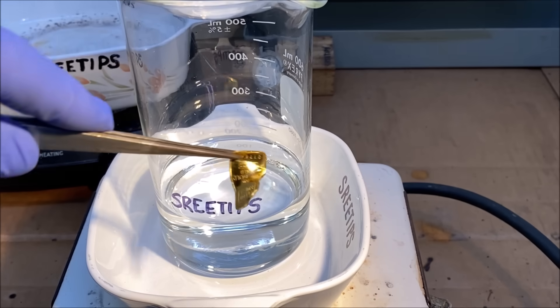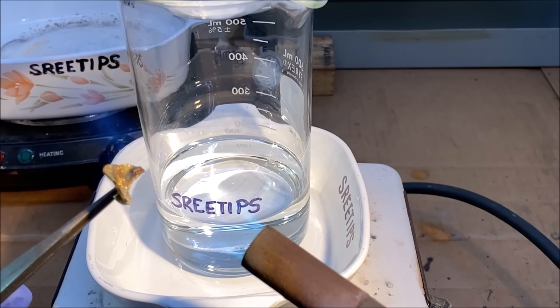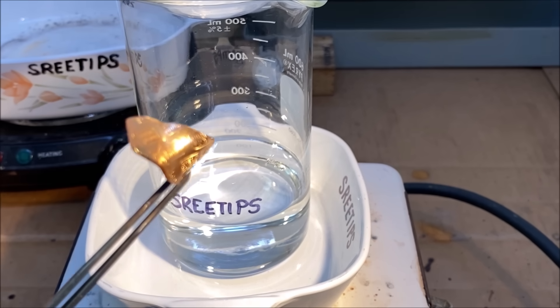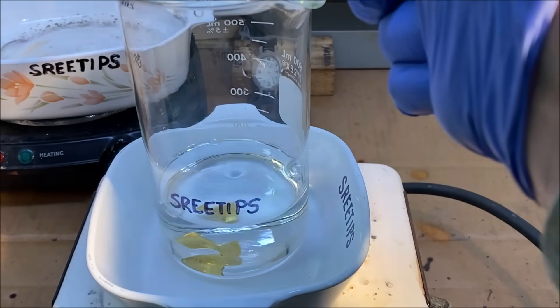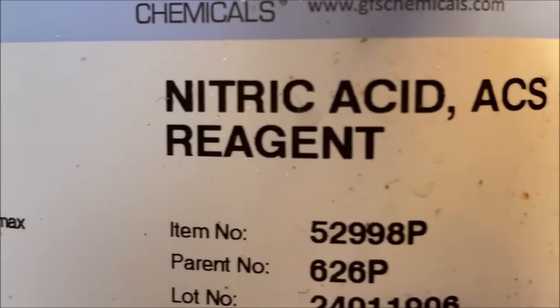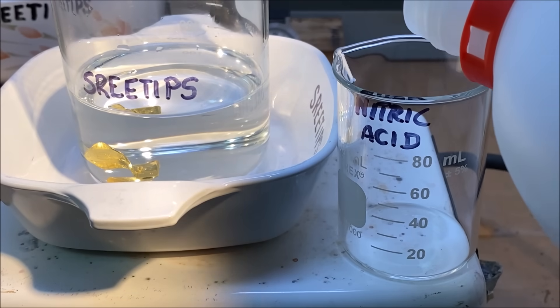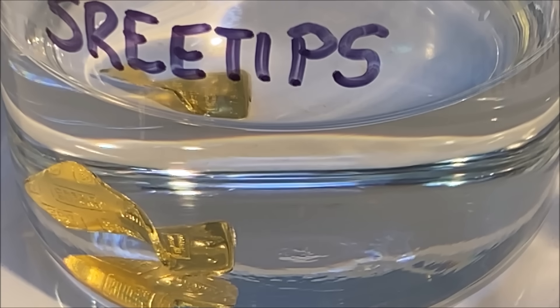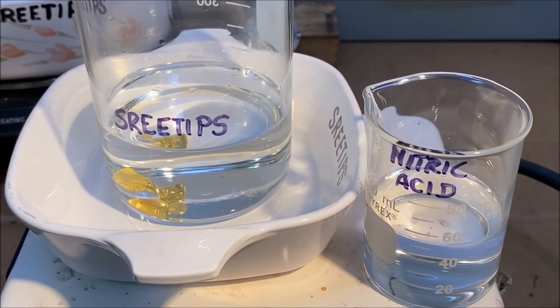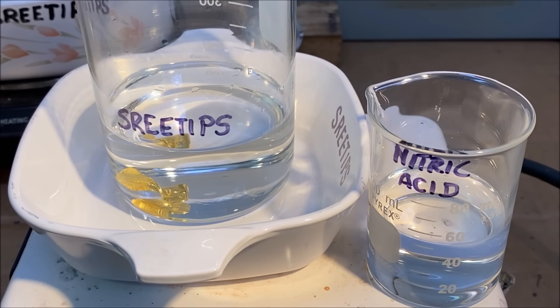I'll heat the gold with a torch until it's red hot, then drop it right into the beaker. Next I'll measure out about 50 milliliters of 68 to 70 percent reagent grade nitric acid — though technical grade works just fine for refining silver and gold. I'll put the camera on time lapse and dump in the nitric acid. That makes a three-to-one ratio — three hydrochloric to one nitric — aqua regia — to dissolve the solid metal. Here we go.